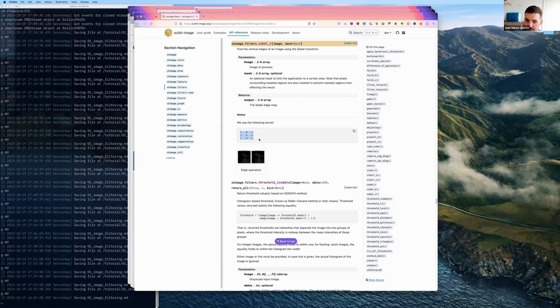You can see it's very similar to before in that you have the positive, 0, negative values, but also you have a bit of smoothing. So the Sobel filter is finding edges that are continued along the orthogonal direction. If you only had an edge for one pixel row value, then it's not enough to give you a high value for the Sobel filter. You need the edge to be continued.